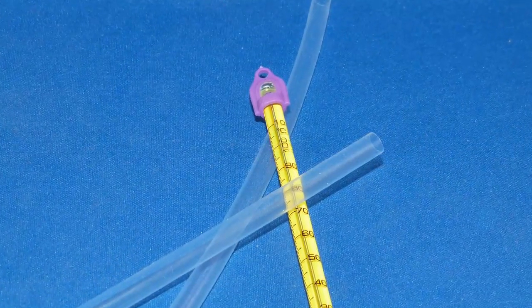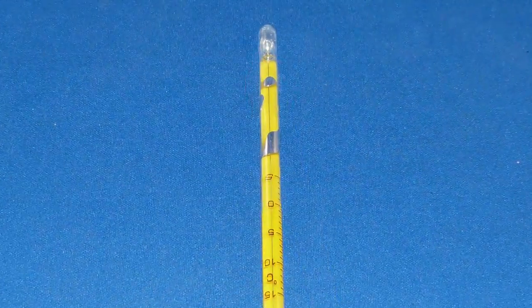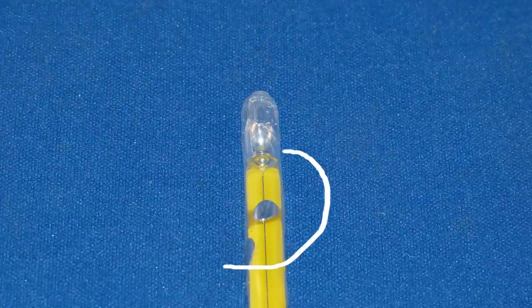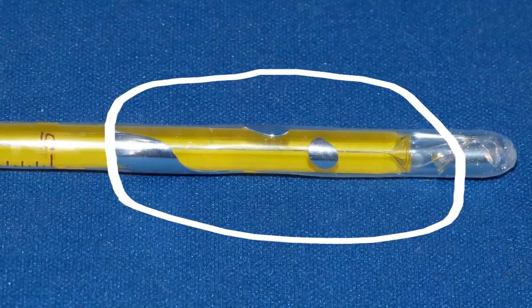PFA safety coating is transparent and designed to make thermometers less sensitive to breakage. In the event that the thermometer does break, the liquid in the thermometer is contained within the PFA safety coating. This prevents contamination by broken glass or liquid fill.